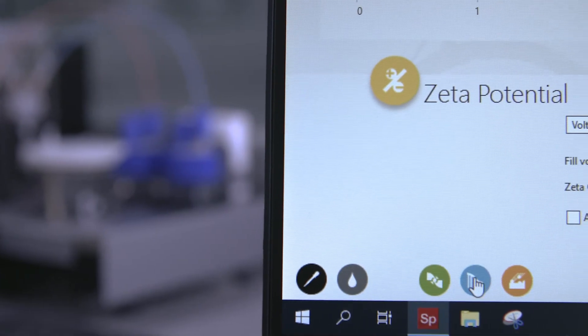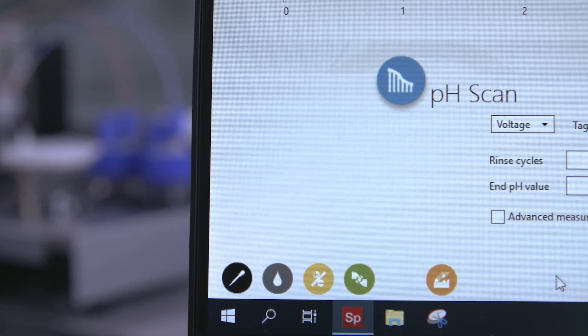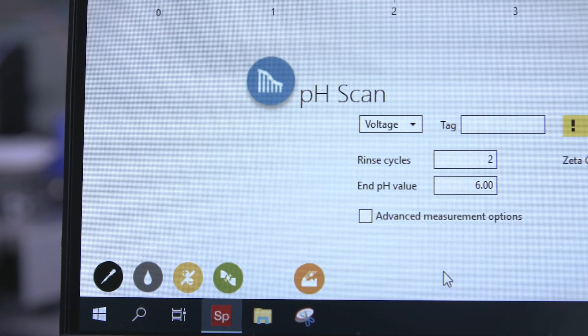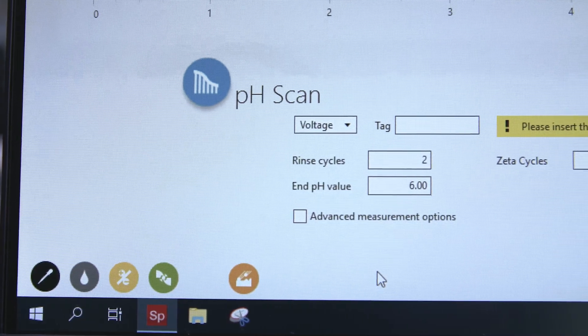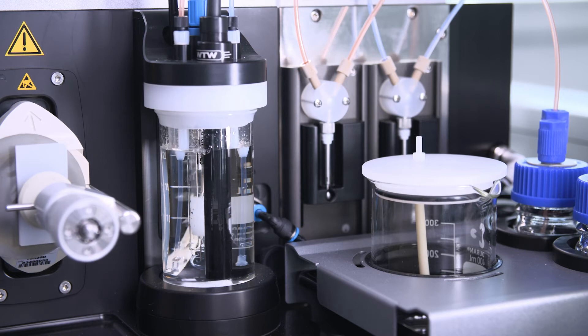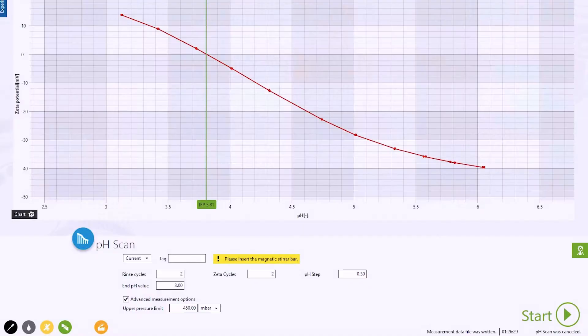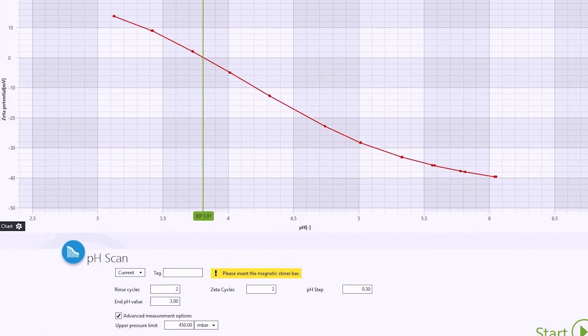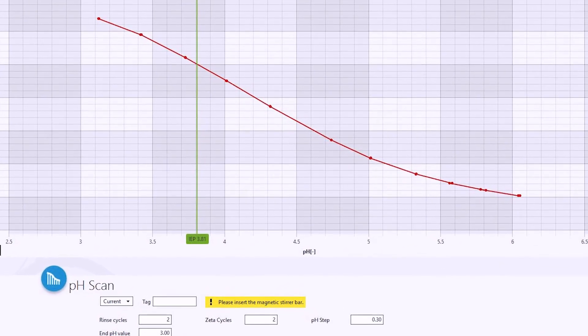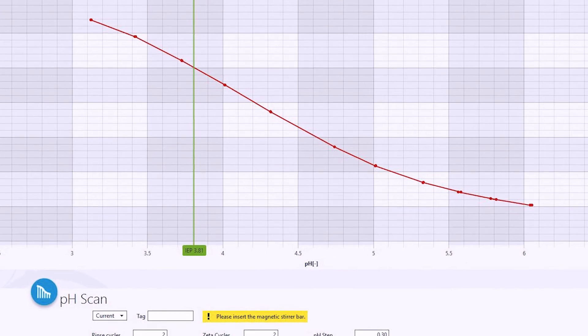Thanks to the integrated dosing unit, pH scans can be performed fully automatically after setting the measurement parameters. The characterization of the zeta potential with respect to the pH reveals what's known as a titration curve. This evolution of the surface charge with pH provides information on the surface chemistry and on the isoelectric point of the solid sample.